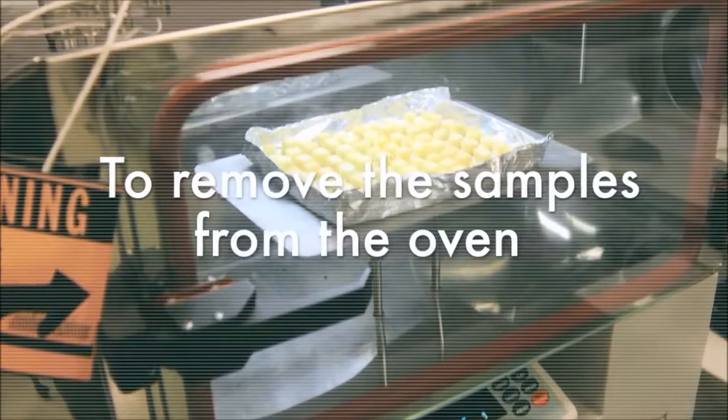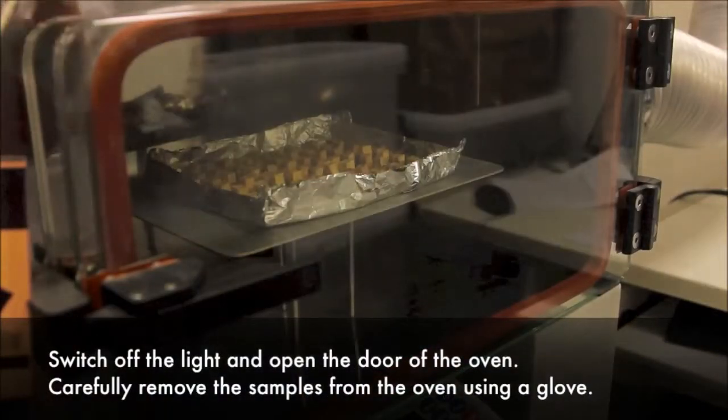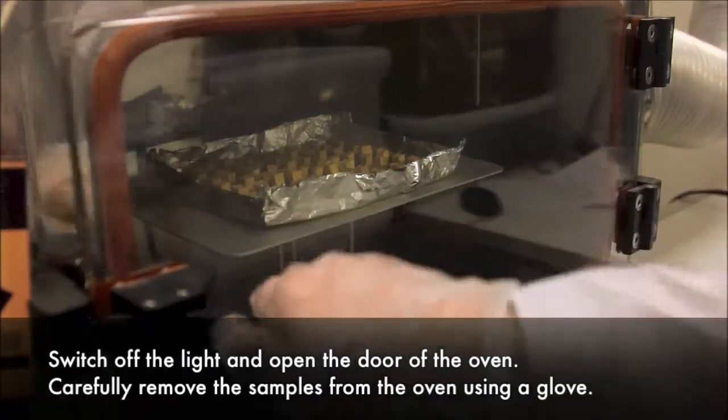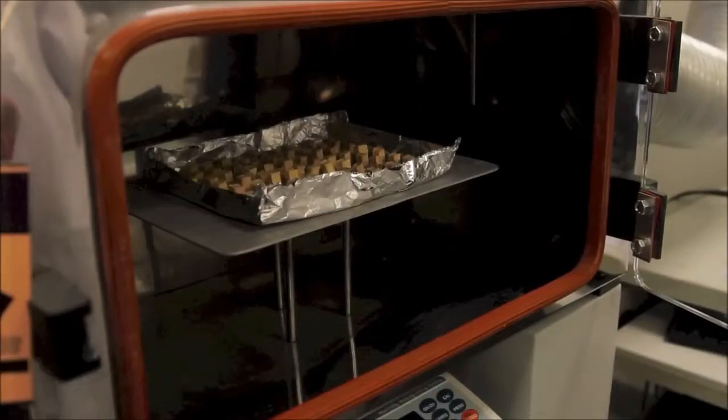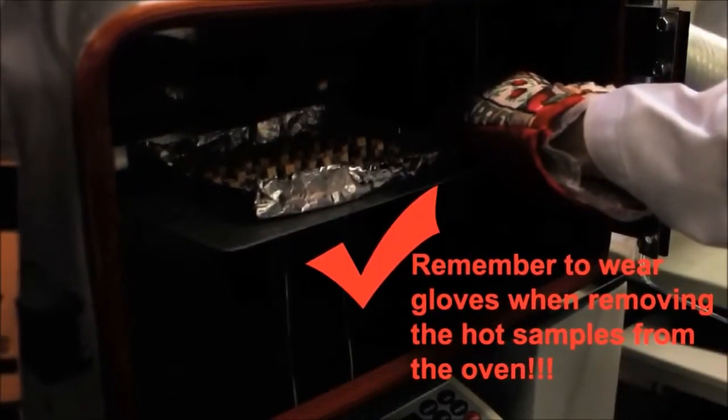To remove the samples from the oven, switch off the light and open the door of the oven. Carefully remove the samples from the oven using a glove. Always remember to wear gloves when removing the hot samples from the oven.